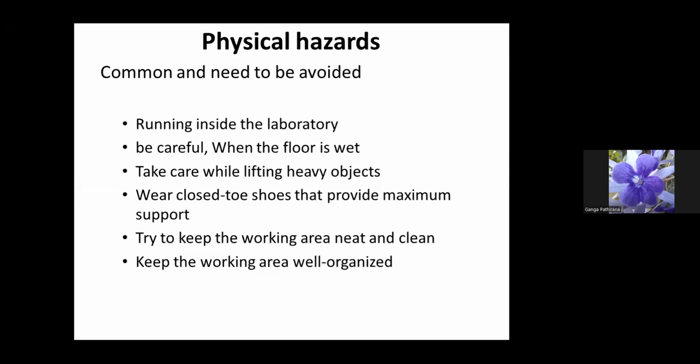Let's discuss physical hazards. They are common not only in the laboratory but in any working environment, and need to be avoided. You should avoid running inside the laboratory and be careful when the floor is wet. Take care while lifting heavy objects. Wear closed-toe shoes that provide maximum support. Try to keep the working area neat, clean, and well organized.